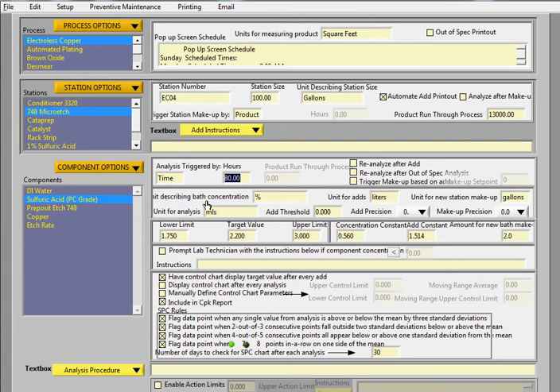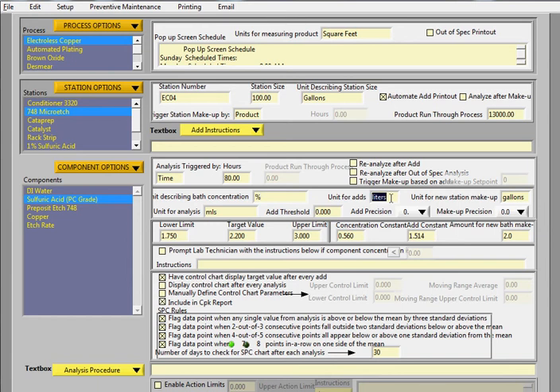There's also a field for the unit for describing the bath concentration. So in this case, it's percentage. And then for add, you can choose your unit. In this case, it's liters. And then for makeup, you can choose a different unit. In this case, it's gallons.